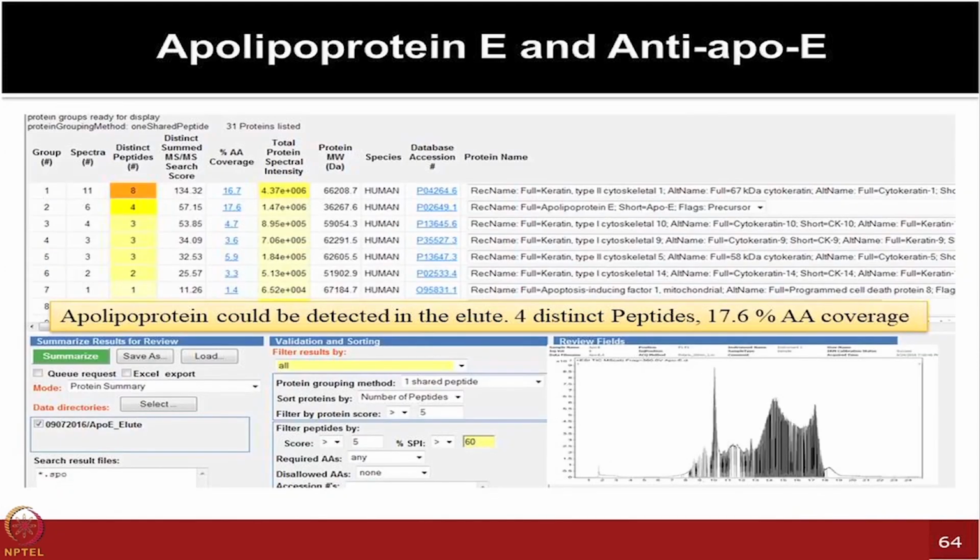So then we tried out another protein which was of physiological interest, apolipoprotein E, and the intention was again to look for their binding. This time we could see 4 distinct peptides. So at least good news was, and we are using QTOF platforms, not the latest Orbitrap technologies, we could see the right protein and detect the right peptides, which was good news.